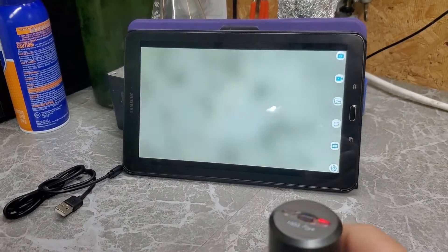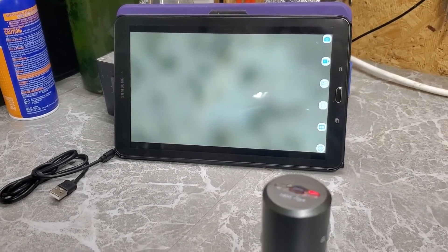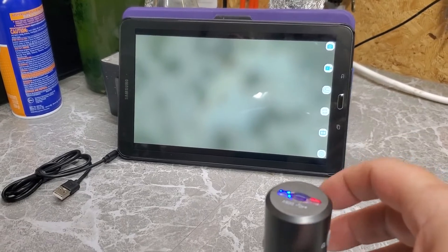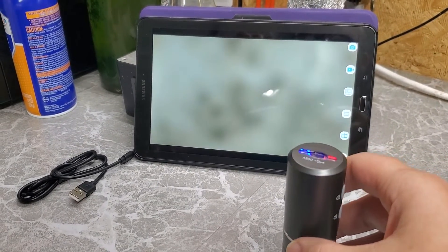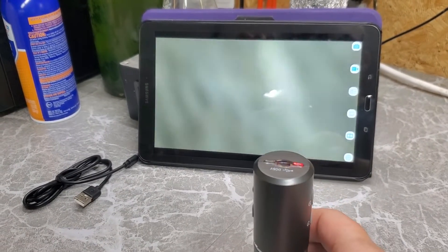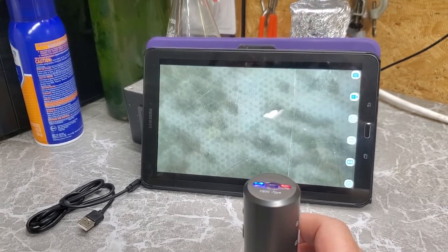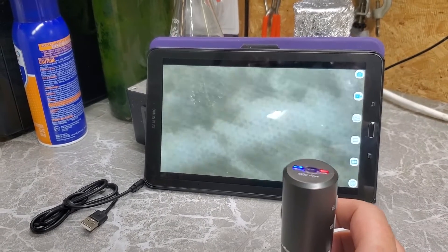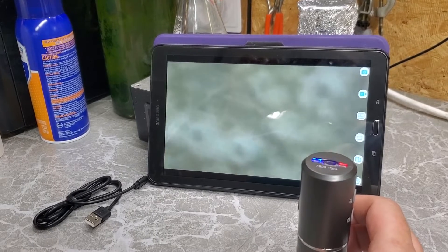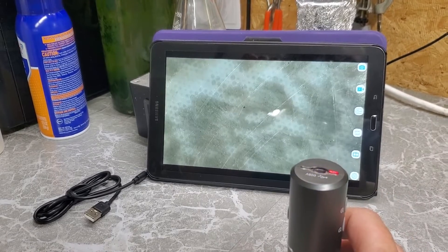I have it all set up. All you have to do is follow the instructions — they're actually pretty concise, straightforward, and work fairly well. This was a very seamless setup. You can see it just transmits in real time what the microscope is seeing over the Wi-Fi connection onto the screen.